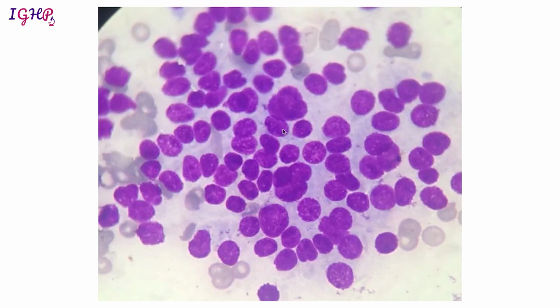Now suppose from the same lesion, the mass in the head of the pancreas, you are getting a sample like this.